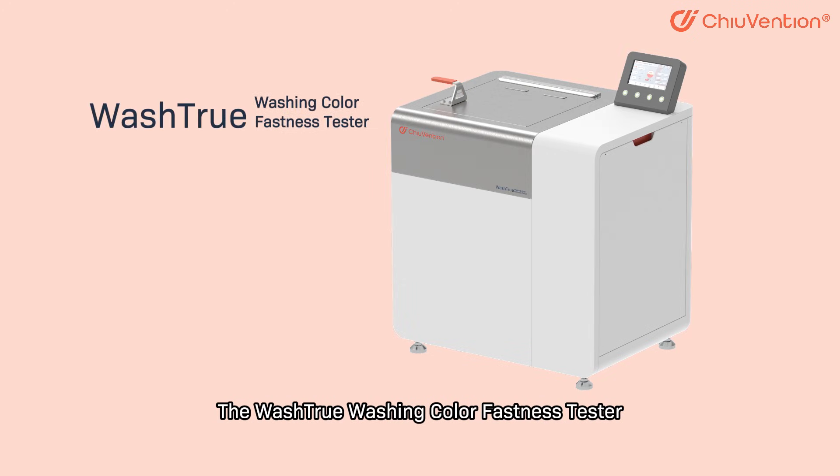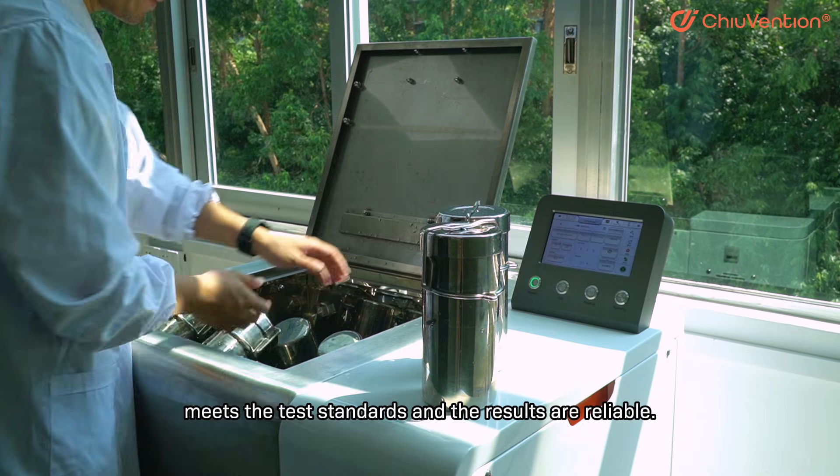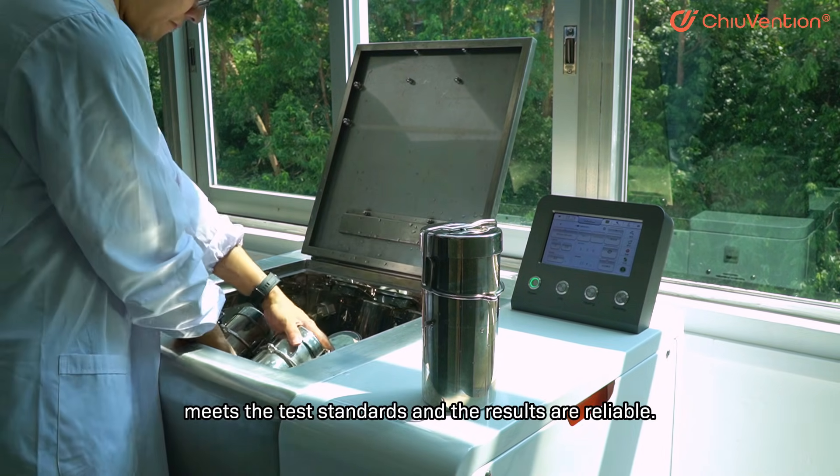The WashTrue Washing Color Fastness Tester adopts a Smart Temperature Control Algorithm to ensure that the washing color fastness test meets the test standards and the results are reliable.